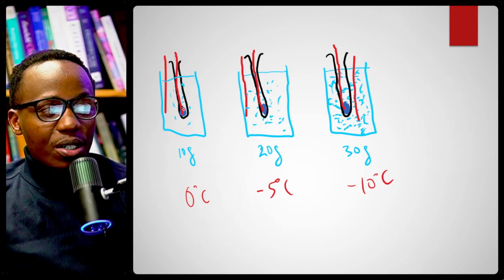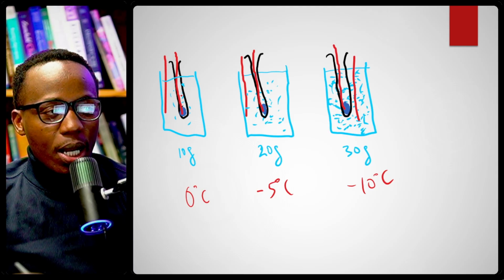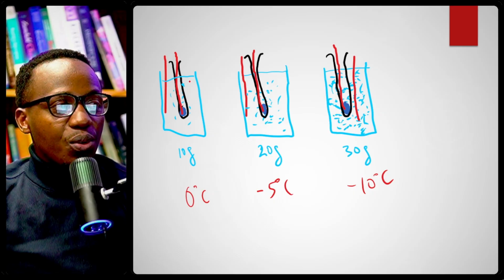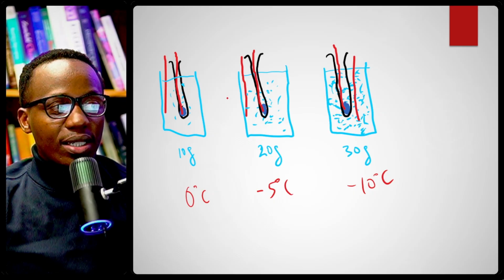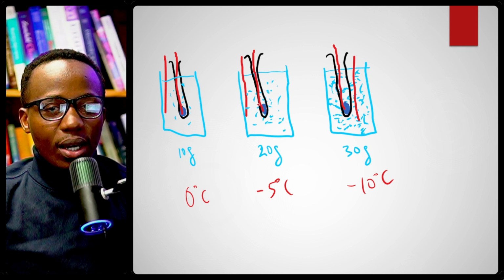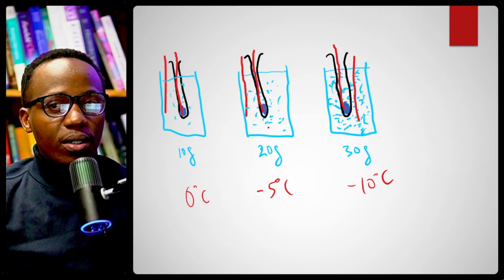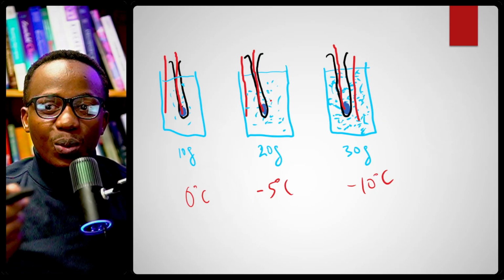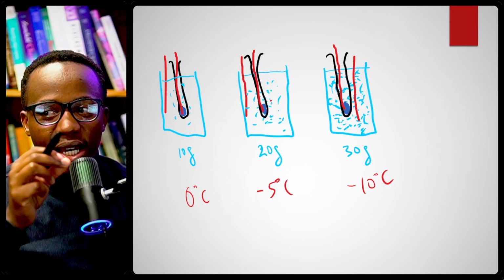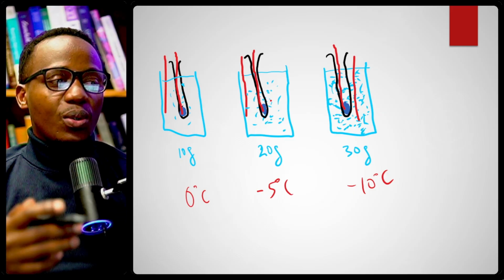Because guess what? At room temperature with just ice, this water is not going to freeze. But I promise you that if you put this plain water with nothing in it into ice water, and then you add salt to it, it's going to freeze. You will see the water freeze in a beaker. It's going to be really cool. Hopefully it's going to work out.